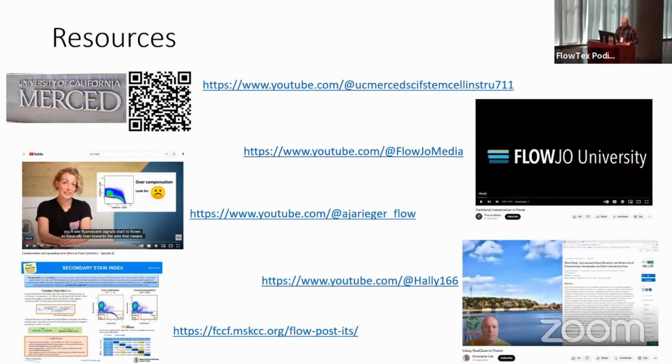So with that, I want to talk to you a little bit about some resources that I find super valuable. In addition to my own stuff, I would recommend FlowJo University, which is the platform I've been using. They've really upped their game with the tutorials that have come out lately. Asia Rieger, one of the SRL emerging leaders in our little data analysis cohort, has put together some really good YouTube videos, much more theoretical, with great graphical content. It makes me very embarrassed by the videos I made that have no edits or graphics or anything. It's just a 20-minute walkthrough.